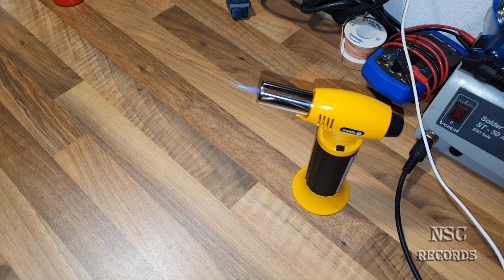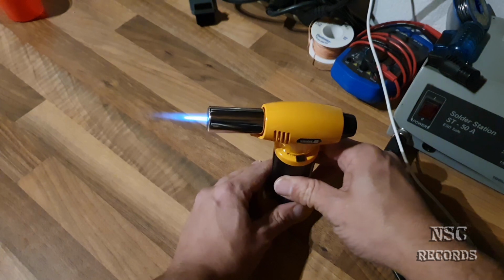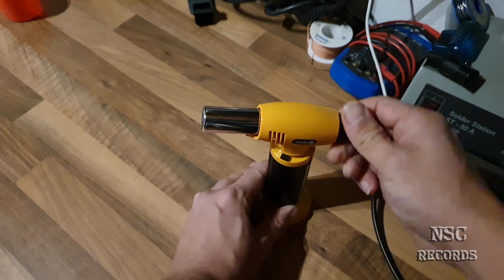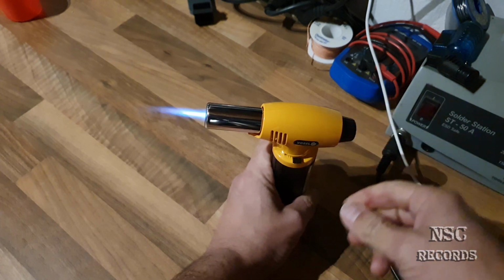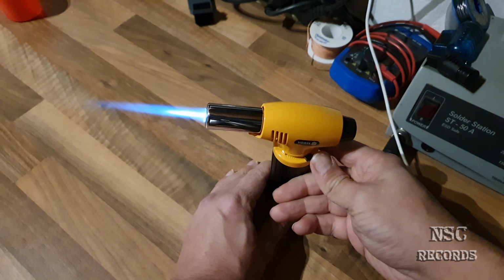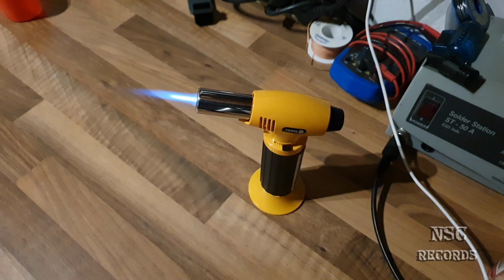Let's make the lights off. Okay. Minus. Okay, now it's off, of course. That was just too low. Again. And turn it to the right side. Then it stays on. Maximum. Oh, yeah. Not bad. Cool.